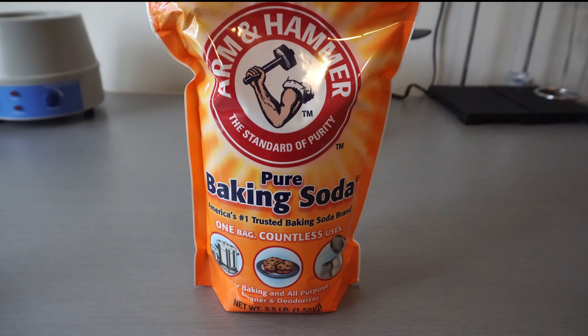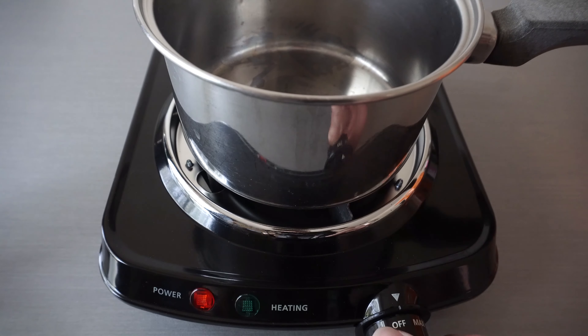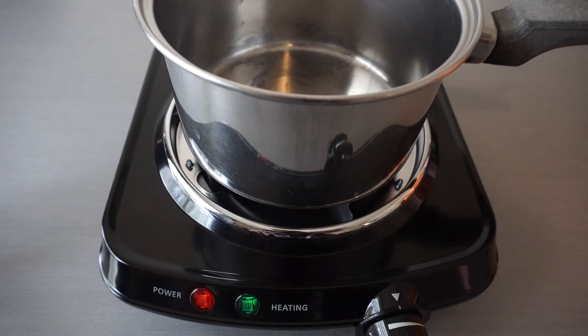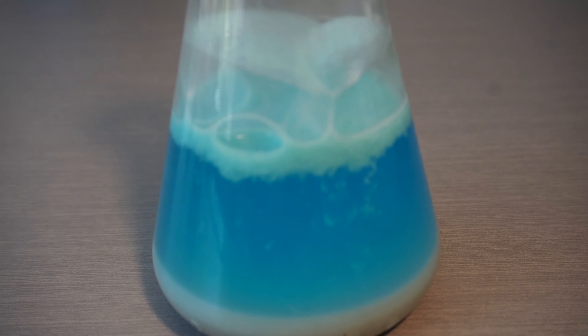Luckily, it's extremely easy to do and all we need is baking soda, a heat source, and a pot. I like to make large amounts of sodium carbonate at one time, because I have used it in many of my upcoming extractions, from caffeine of the death wish coffee, to making copper carbonate.